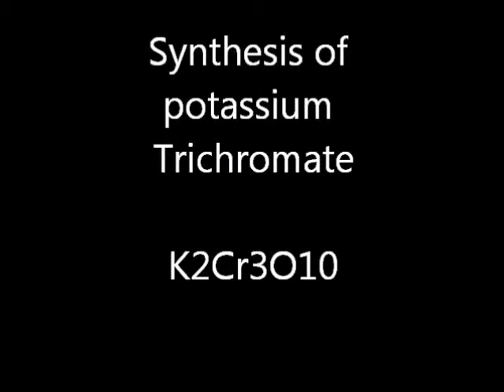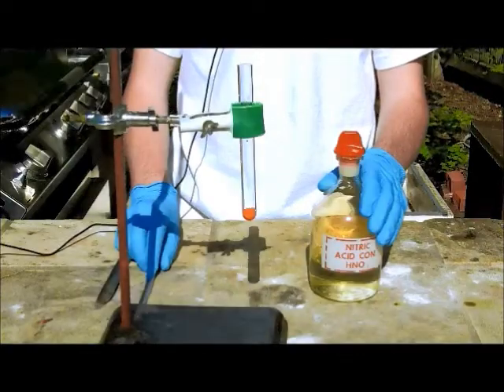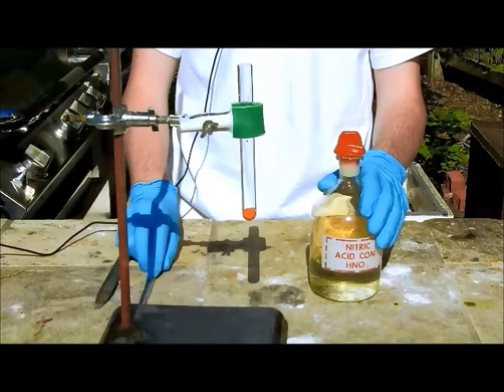Warning: this experiment uses hot concentrated nitric acid and carcinogenic hexavalent chromium. Please be careful if you attempt to repeat it. Hey everyone, in this video I'm going to be making potassium trichromate.